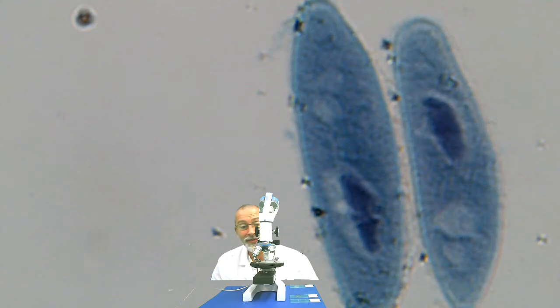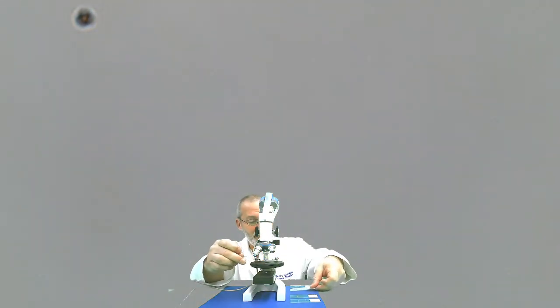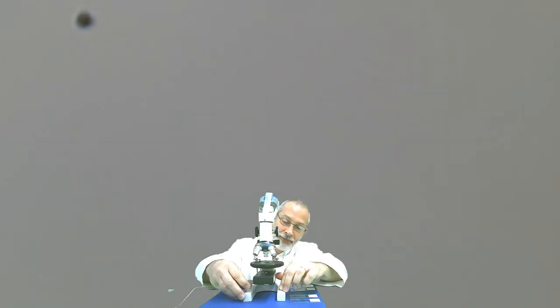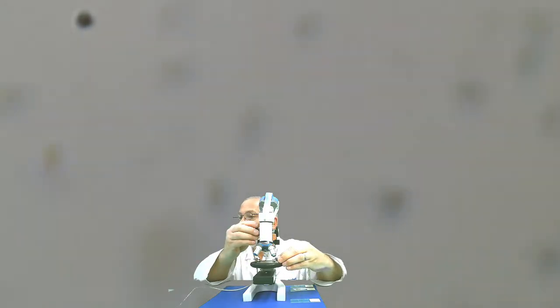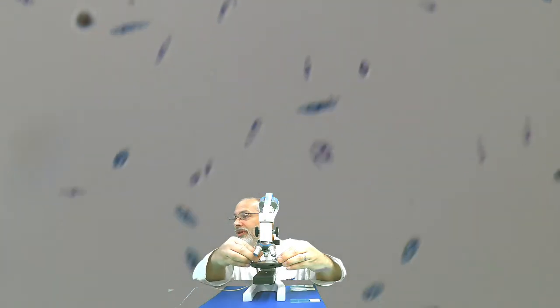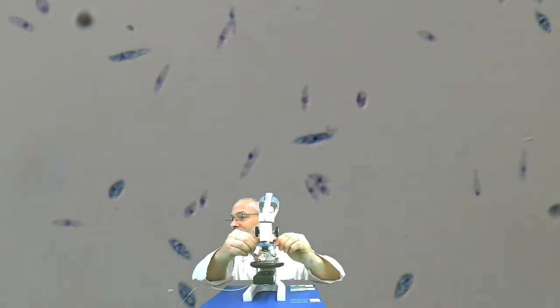All right, hopefully you had enough time to do that. I'm going to remove the slide, return it back to 40 times magnification, lower the light a little bit, and bring in our next specimen. Our next specimen are Euglena. Euglena. And here are our cute little Euglena. So there's a good view.